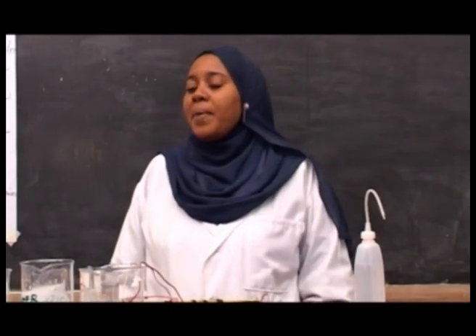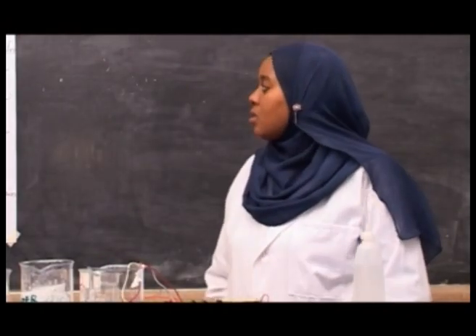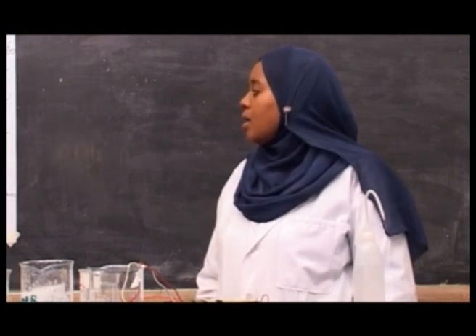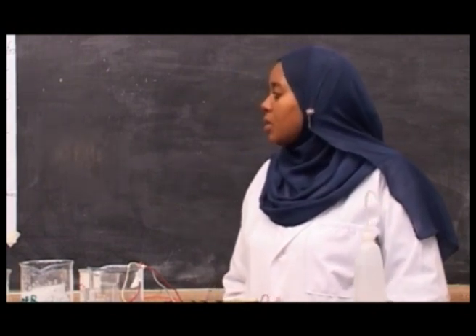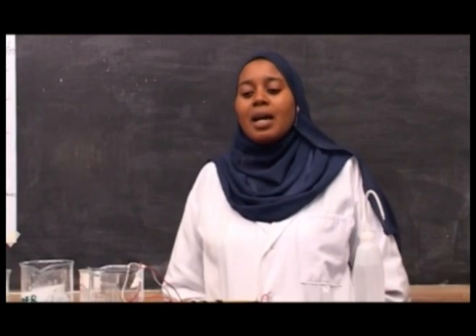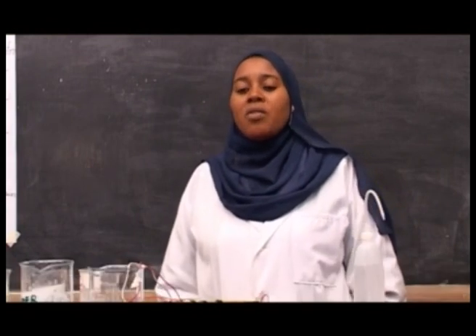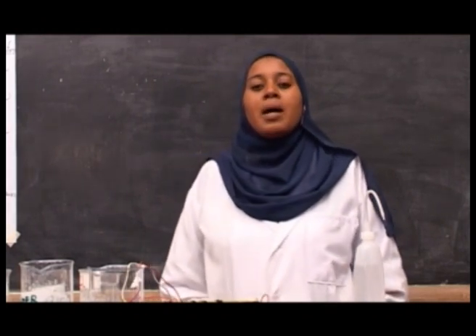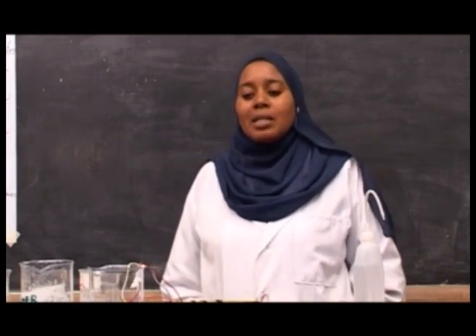When you compare these results of wax, sodium chloride, sugar, ethanol, ammonium hydroxide, and acetic acid together with hydrochloric acid, you can see the difference. In hydrochloric acid, you have observed that the bulb glows very strongly, and in sodium chloride solution also the bulb glows with a bright light.